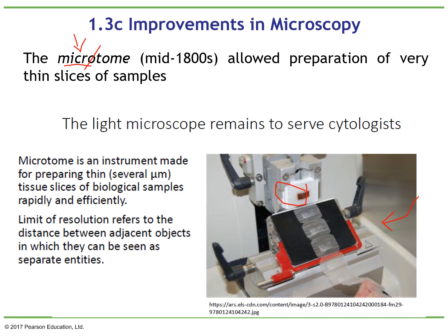If you remember in your introductory biology, you had to cut a thin slice of an onion, which is wonderful because it has large cells and is very easy to cut. However, there are samples that are very difficult to cut. For example, I have to cut fly legs that are very thin and difficult to cut.